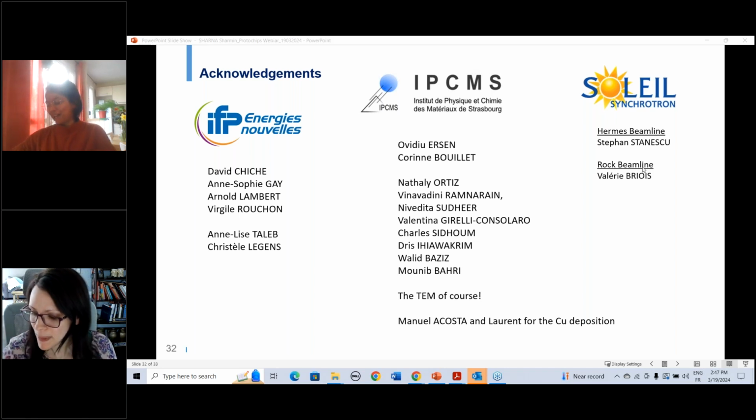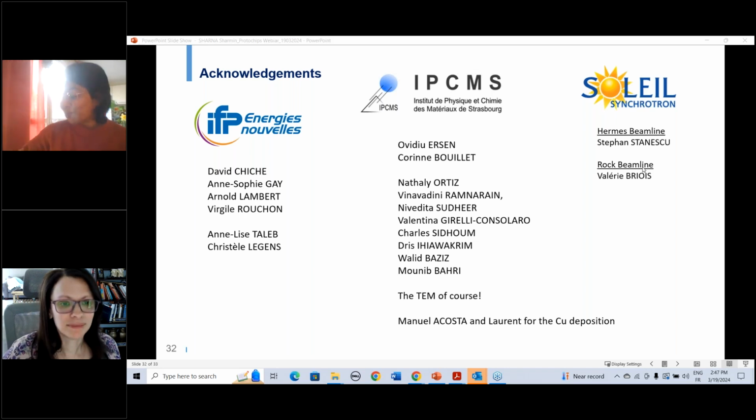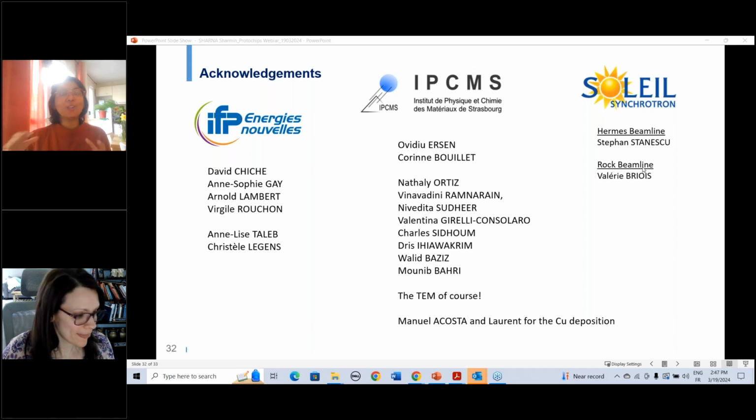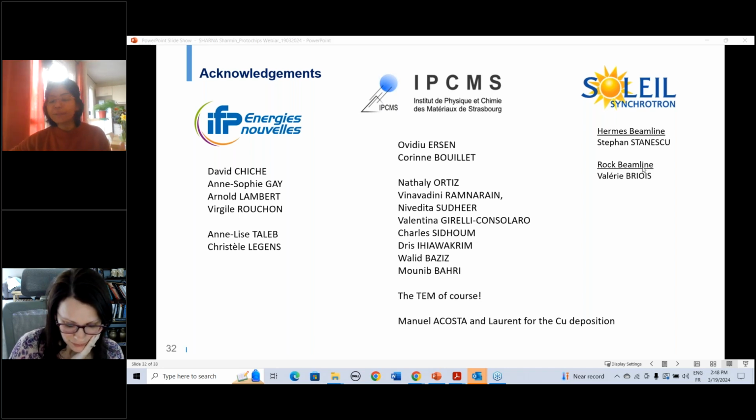I mean, of course, I would not be able to recommend for a model system like the one we did for the nanoparticles. That is super specific to the TEM. I wouldn't know how you can do it without the presence of a TEM. It has to be in a glove box, because it's sensitive to air if you want to do oxidation reduction. But for the actual material, the industrial material, supported material, you can do a range of tests.